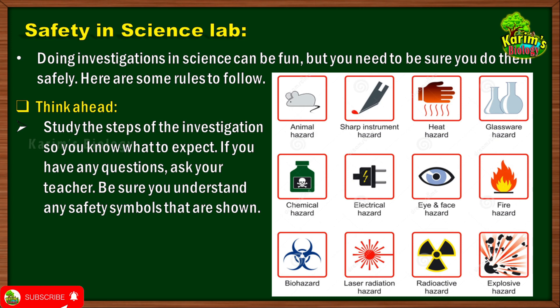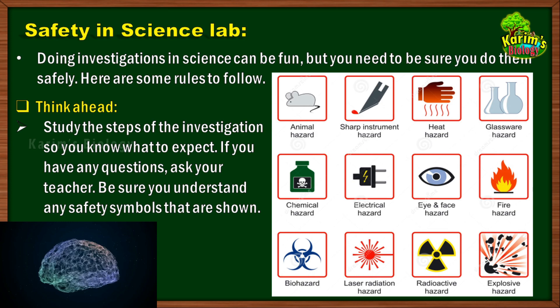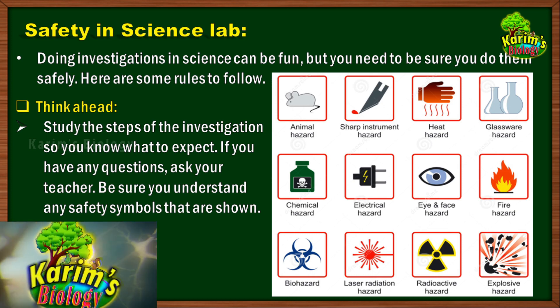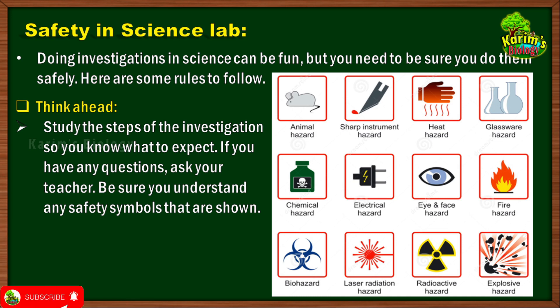Before you start doing any experiment, you should make a note of all the requirements and arrange them in order. Then you can start doing the experiment. There may be some chemicals, glassware, or apparatus required for performing experiments in the science lab. When you look at the chemical compounds, glassware, or apparatus you are using, there will be some labels on them with symbols printed on those labels.